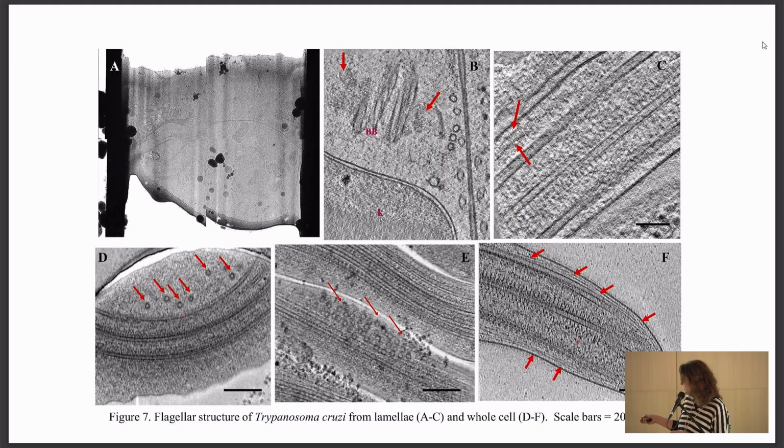We also observed those thin filaments, very similar to actin filaments, observed in the tip of the flagellum. So our plans, those are our initial data coming from the recent microscope that we have, the Titan Krios, and then we want to look at the molecular identity of those structures and compare them with the IFT trains.